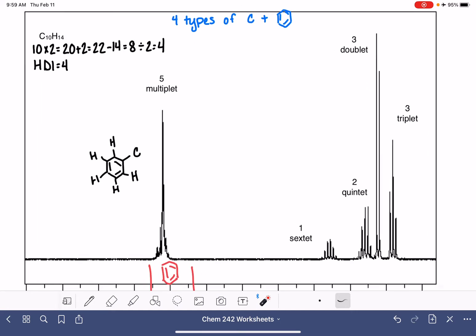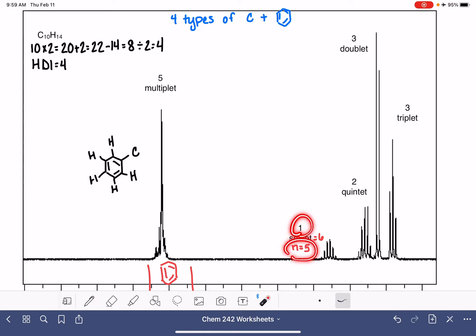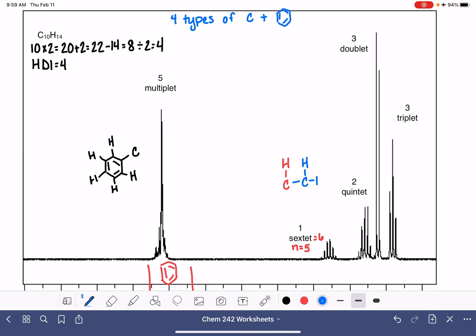Let's go ahead and take a look at the rest of our peaks. From left to right, we have one that is a sextet. That means N is five, so we have one hydrogen atom with five neighbors. That probably means we have one hydrogen atom that has three neighbors to one side and two neighbors to the other side — so it's probably something like that.